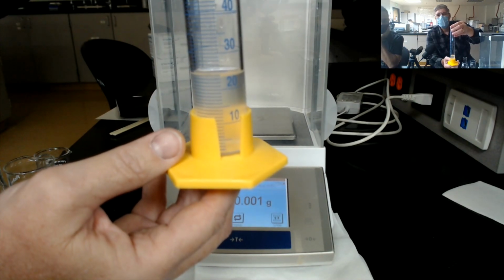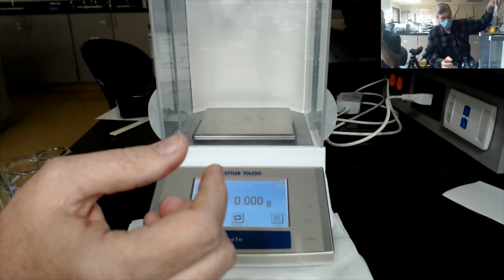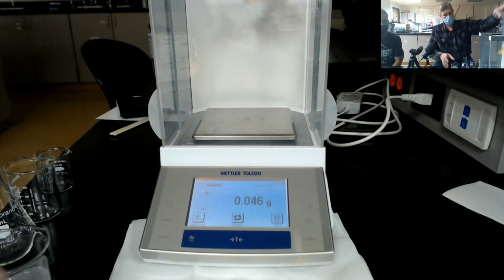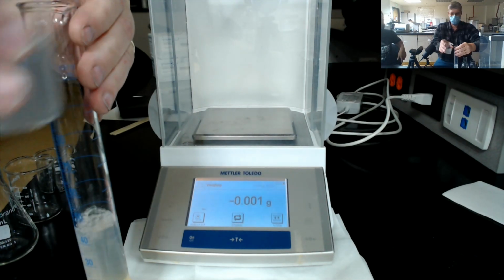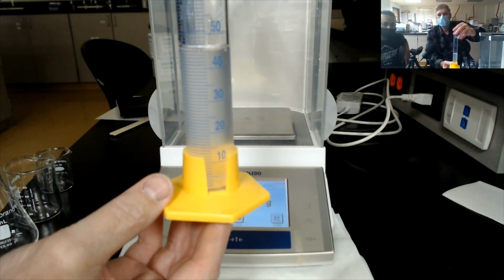All right, now that we know the volume, we are going to weigh the cylinder and the liquid together. Okay, zero still there. All right, record the mass of this volume of liquid. Now we're going to add some more of the unknown, and just like before, we're going to record the volume directly.